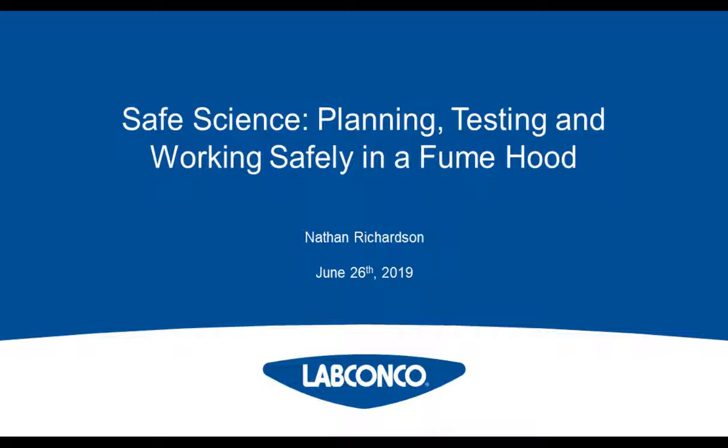Thank you, Catherine. It's great to be here and have a conversation with all of our guests about safe science. We're going to look at planning how to design a lab a little bit more efficiently and picking the right hood for the application, testing procedures both on the front side for development of fume hoods and standards, and then during installation, and then the continued testing to make sure that equipment is working properly. And then probably the most important piece is working safely inside of the fume hood.